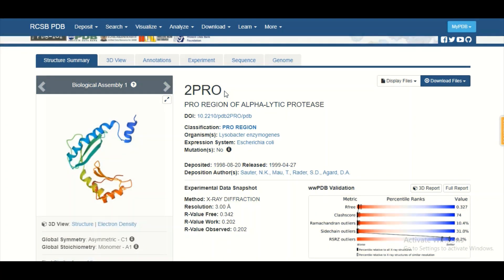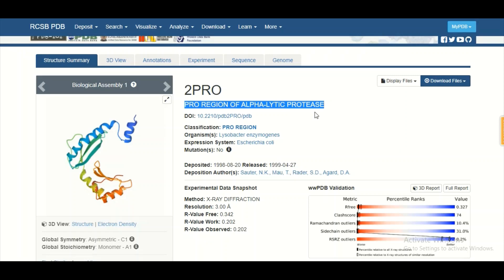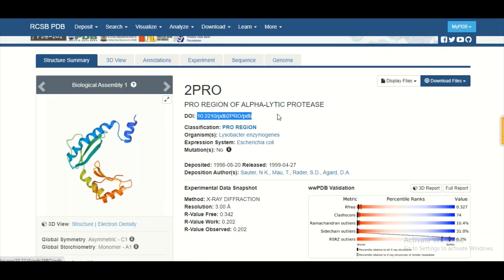The first four-letter code you can see here is known as the PDB ID. This four-letter code is a combination of alphanumerics and is a unique identifier assigned to the protein structure when it is submitted to the Protein Data Bank. On the second line, you get an idea about the name of the protein, which is pro-region of alpha-lytic protease. The third line shows the unique identifier assigned to the manuscript in which the structure is published, also known as the DOI number.